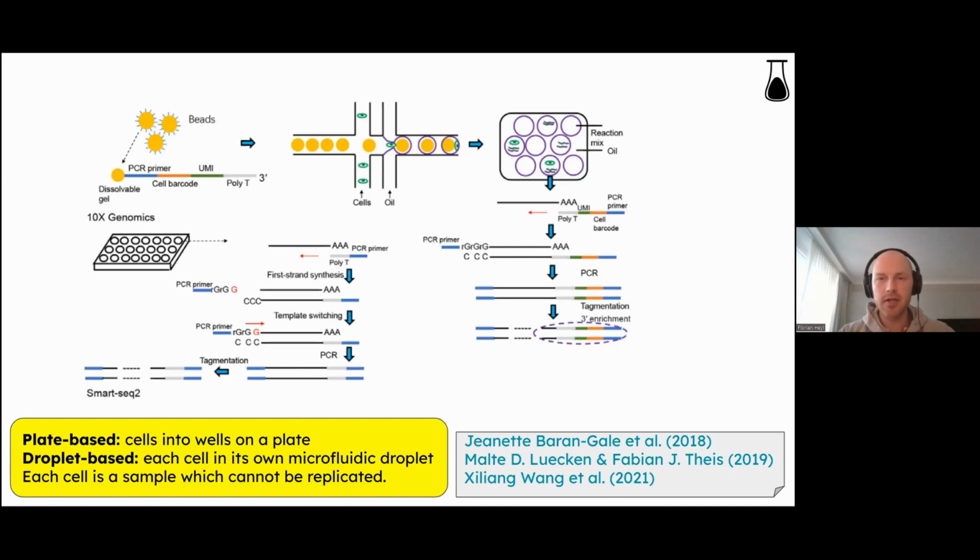So in order to compensate for biological variance, you have to capture a lot of different cells and create a, I want to use the word cohort, but cohort is used for patients. But you get the idea, a cell assemblage. You have to create a big cell assemblage in order to capture the biological variance. So to basically do what you do with bulk with replicates.